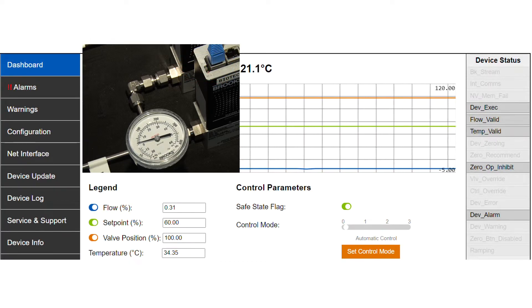Now I will increase the pressure back to the correct value that the device was specified to operate at. On most bioreactors, this is approximately 35 PSIG. As you can see, the valve responds and correct flow is immediately re-established and the alarm automatically resets.